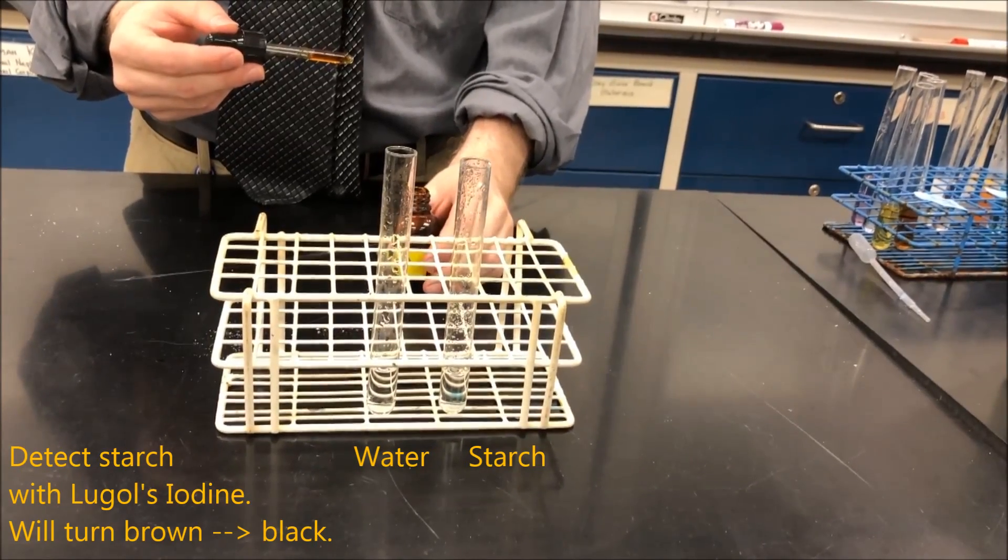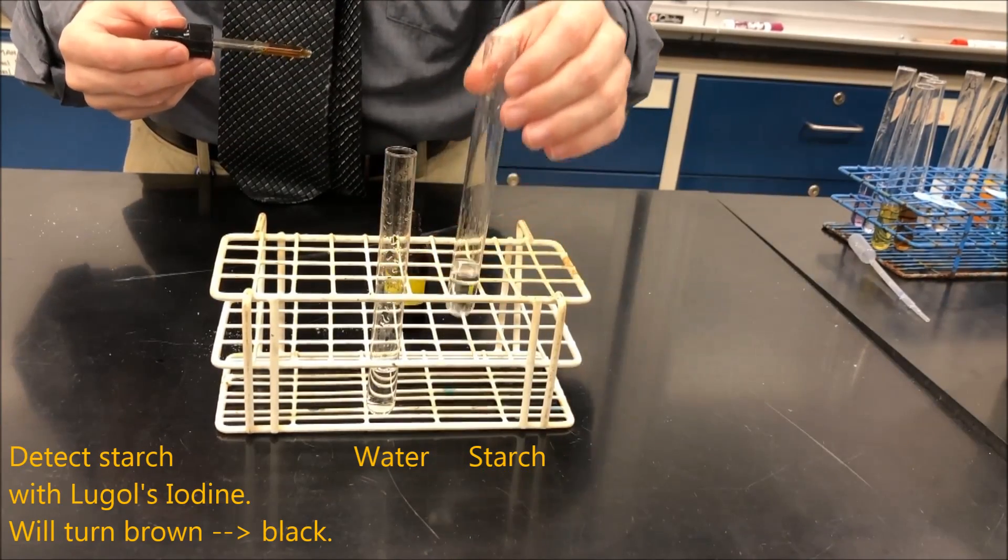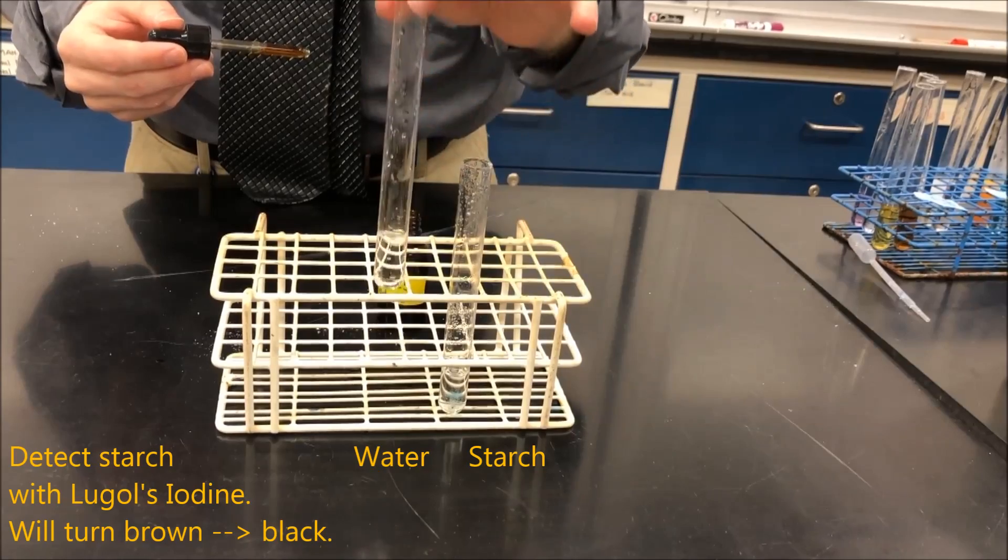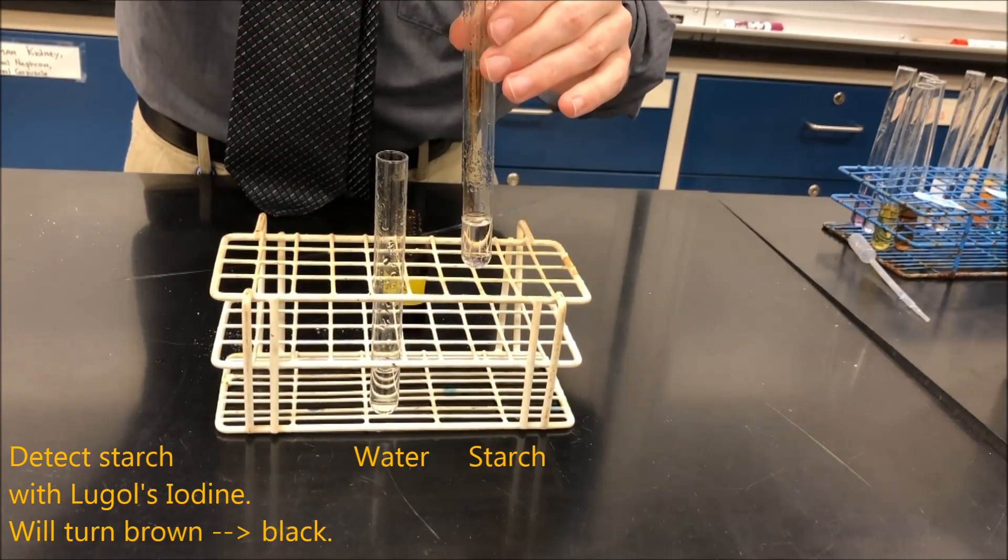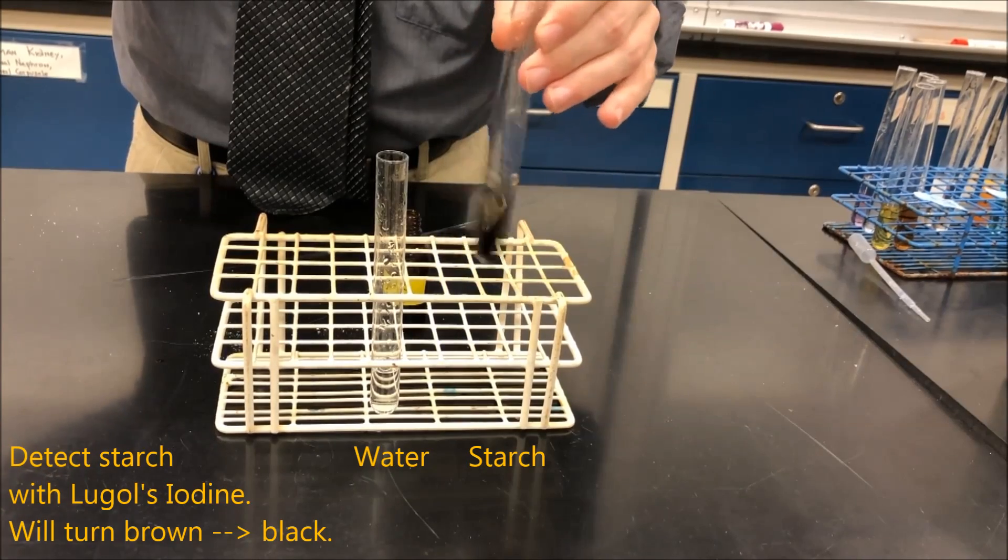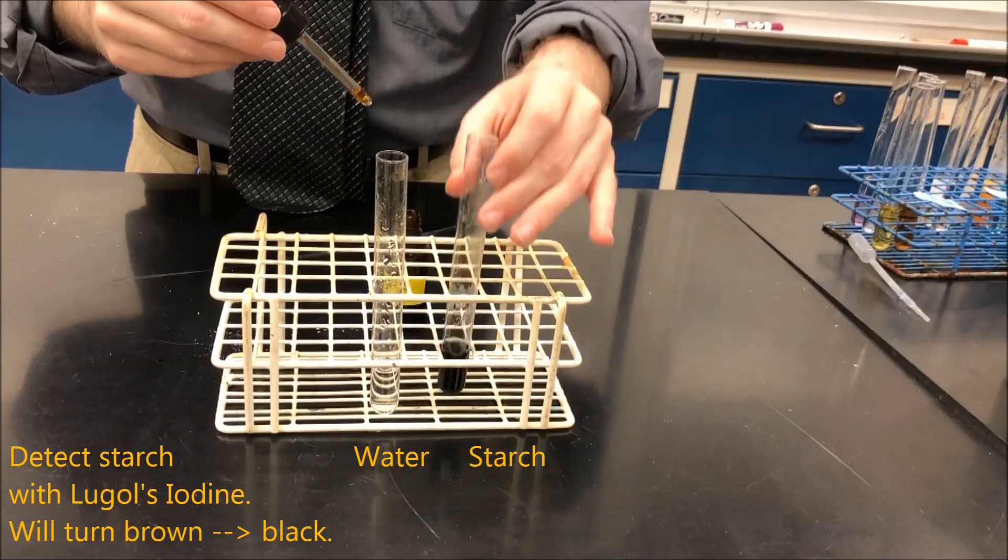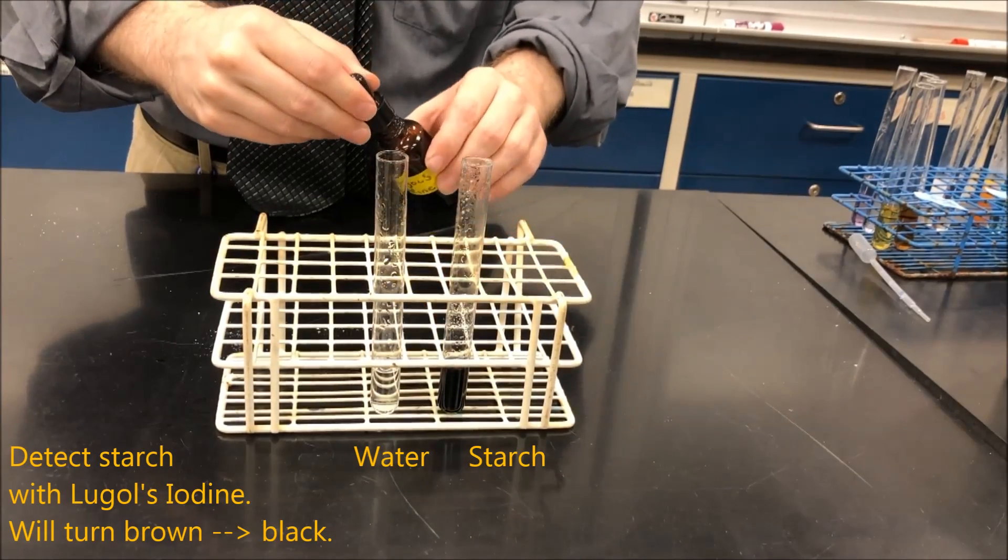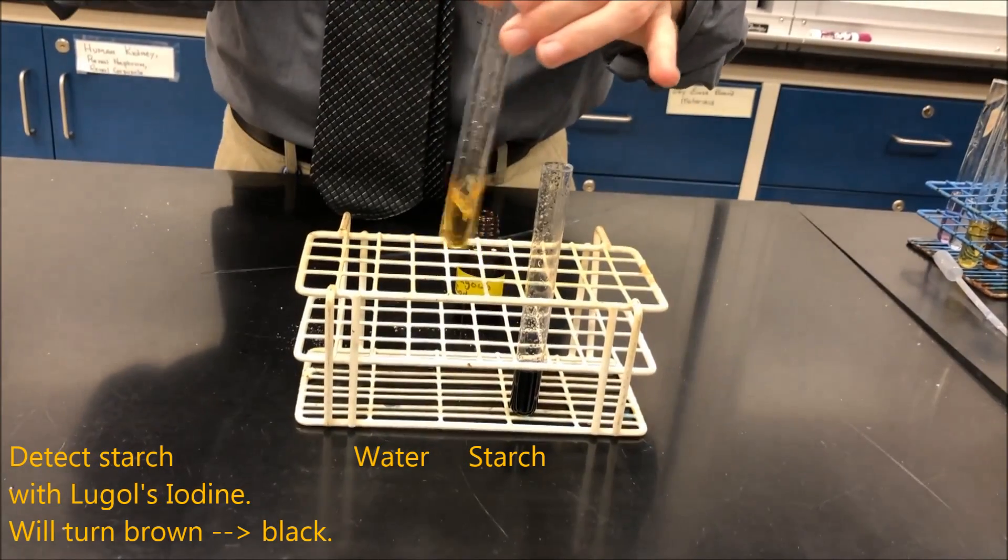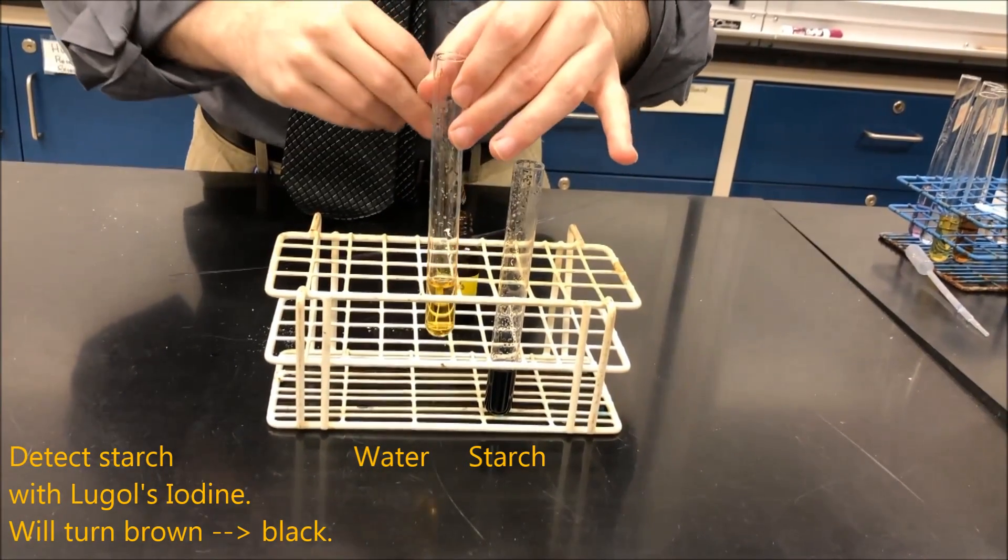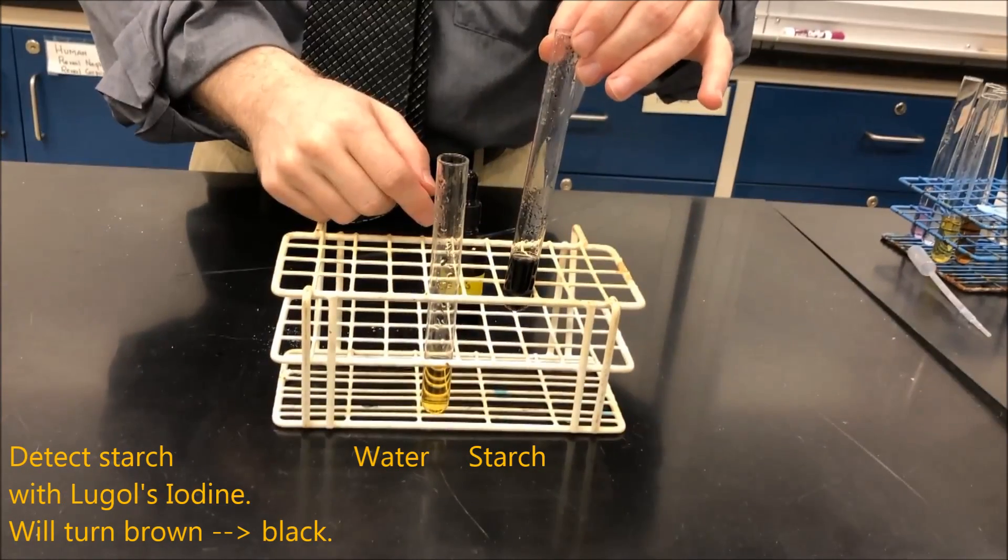To detect starch, we can use some Lugol's iodine. So here I have a test tube that contains a starch solution, and here in my control, I have some water. So I'll add a few drops of iodine. And you can see it turned from a brownish color to a black color, indicating the presence of starch. And for my control, here is some water and a few drops. And you can see that it remains brown. So when it turns black, that indicates the presence of starch.